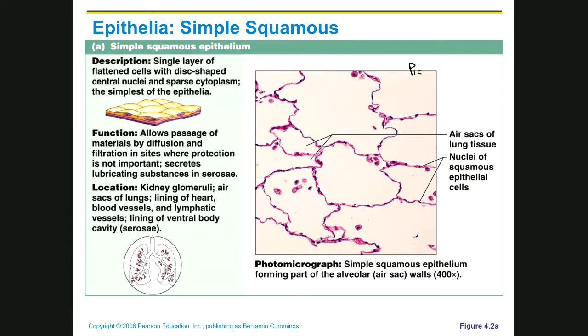So what this is, is in the lungs, and the lungs have little tiny sacs in them like this. They're called alveoli. And what we're looking at are alveoli that have been cut. So there's one alveolus. It's a sac. It's not a cell. Look, these are the cells right here. That's a cell. And there's its nucleus. Same thing right there. That's the cell.